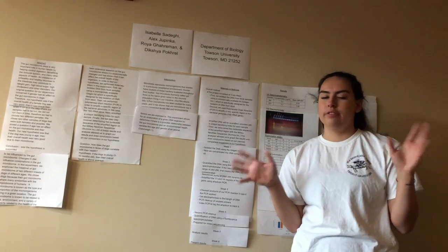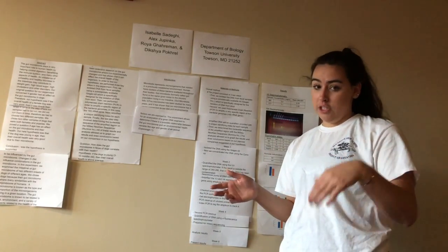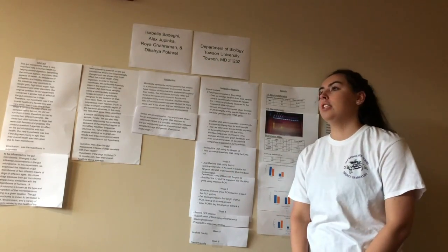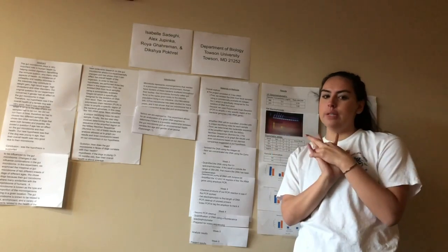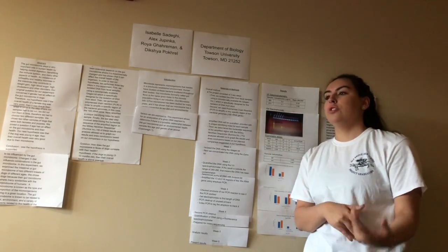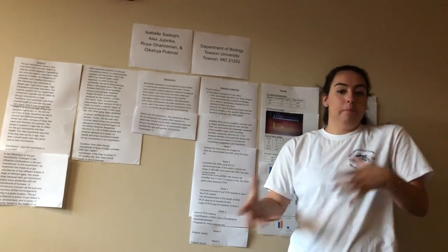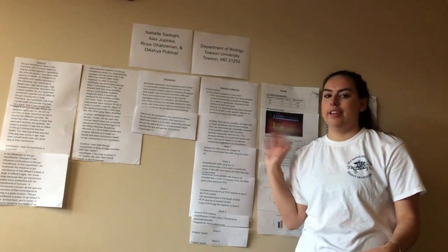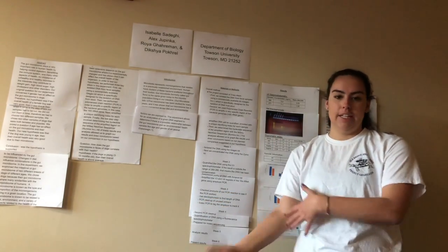So what our results tell us about the cross-contamination is that it happened somewhere around the middle of our processing of DNA concentration. There's a probability that we either didn't follow a specific step, or by accident we mixed up a sample, which resulted in our inaccurate results of DNA.